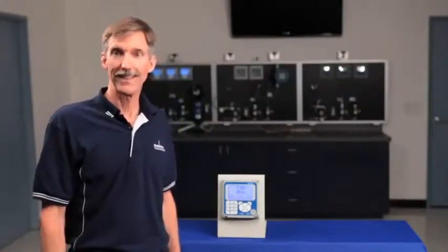Hi, my name is Pete Anson. I'm a Product Manager at Rosemount Analytical, and this video will talk about ease of installation with the Model 56 4-Wire Analyzer.